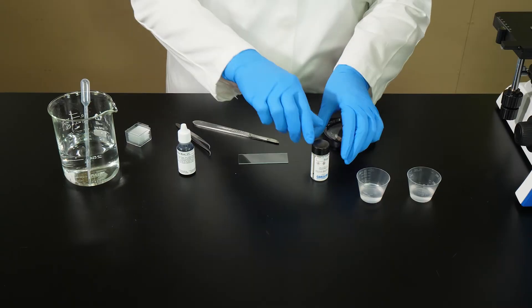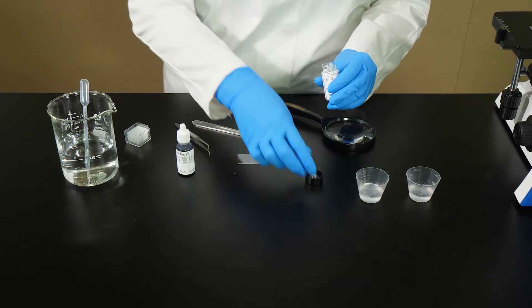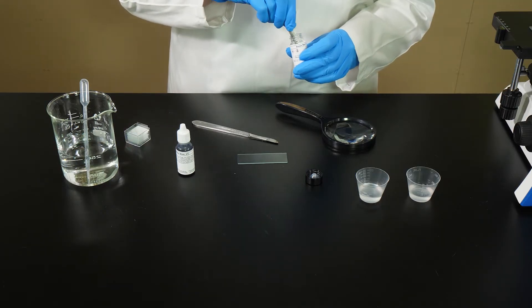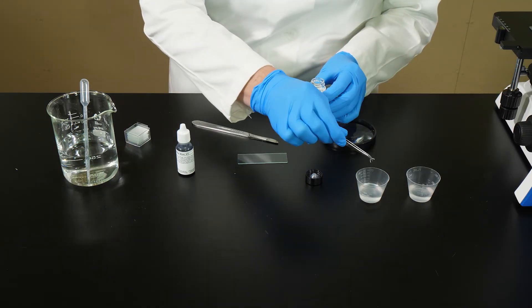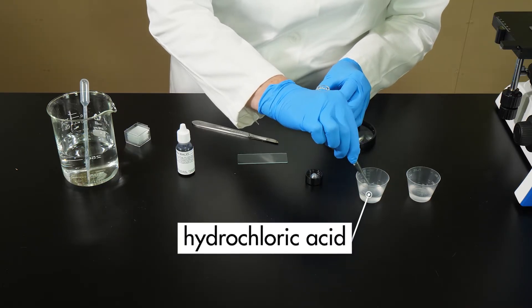Tiny samples have been cut from the tips of onion roots and preserved in an alcohol solution. Several steps are needed to prepare the sample for viewing under the microscope. To break down the plant's hard cell walls, the sample must be soaked in hydrochloric acid for four minutes.